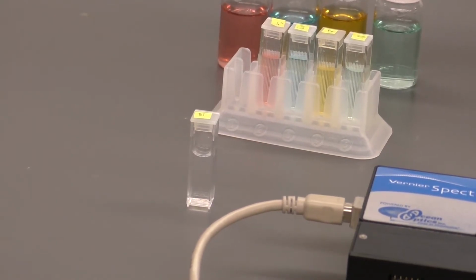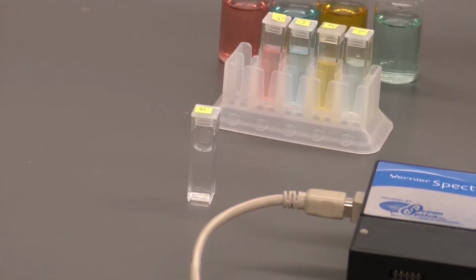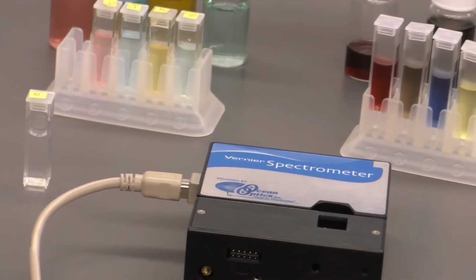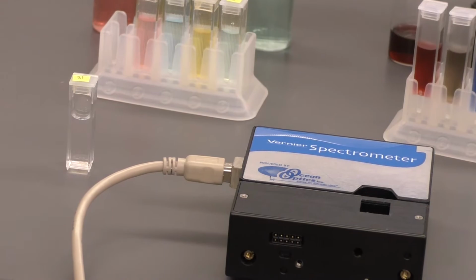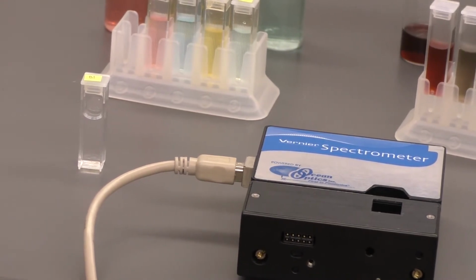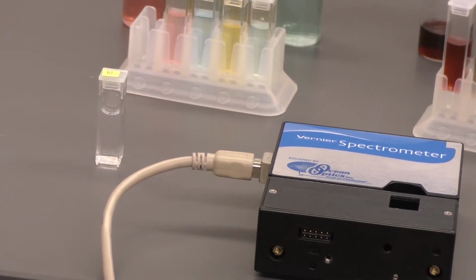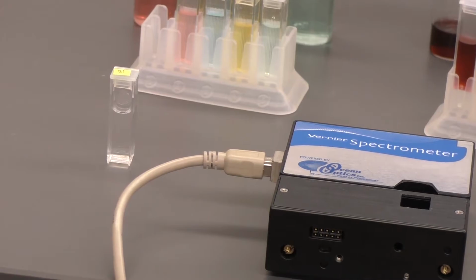So we are going to show you here in a minute how to blank this spectrometer so that when we put the blank solution into the spectrometer, it's going to record that and store it, and every time we make a measurement, it's going to subtract the absorbance of the solvent, in this case water, from the reading we get from the solution, so that the only thing that's going to show up on the screen is the absorbance due to the metal ions.